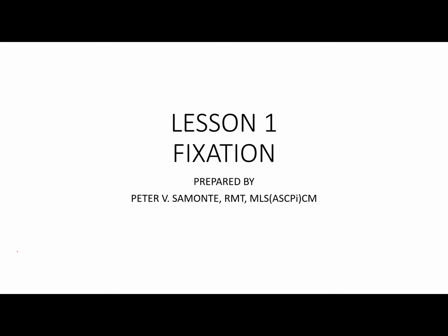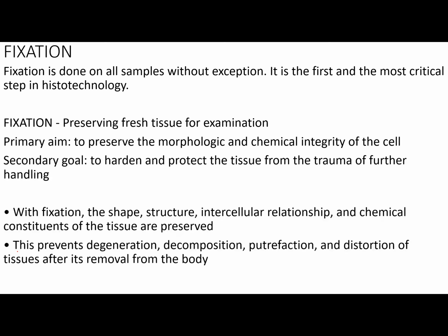This would be your first lesson, class, in your histopathology. We have your fixation. Now, fixation, class, refers to preserving fresh tissue for examination. So, yan yung way of preserving your tissue in histopathology. Now, fixation is always done, class, on all samples.